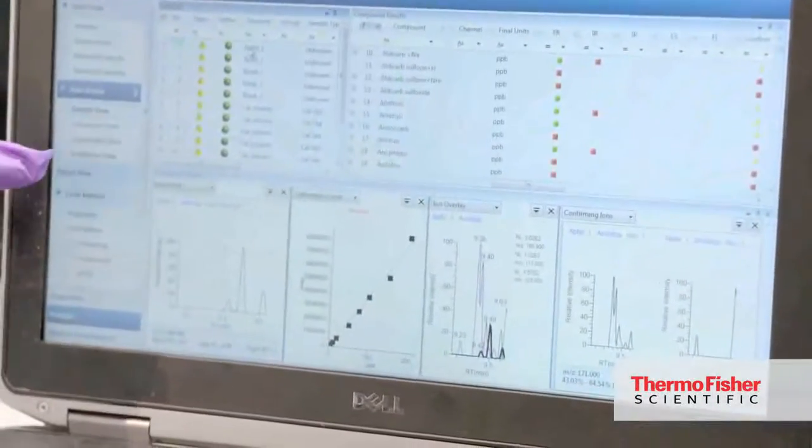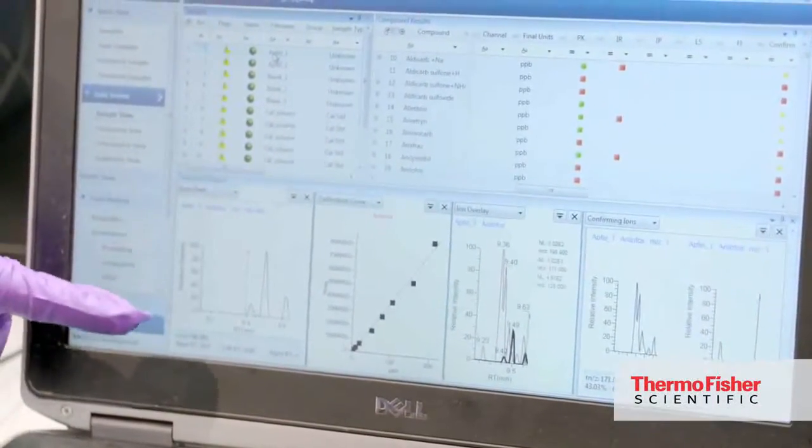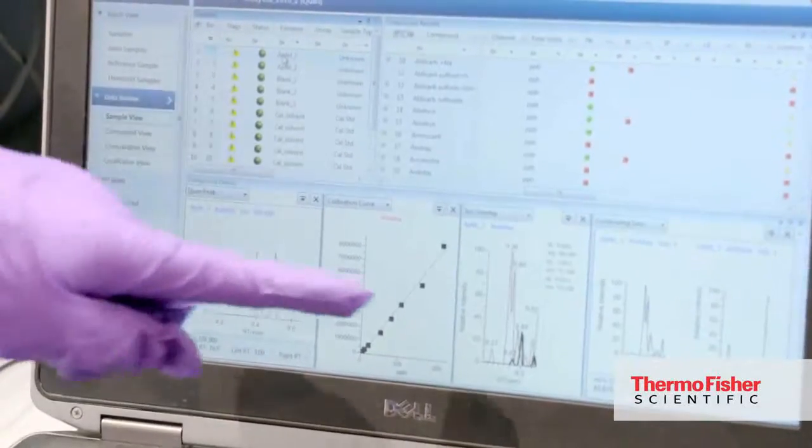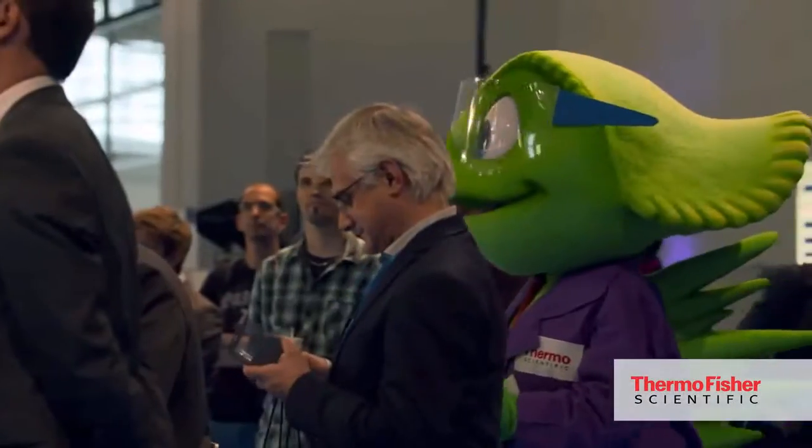Based on the evaluation of data, we have found out that our apple samples are safe, are clean, they contain no pesticides and are safe for the consumers. So we were just distributing these apples to the audience here and they were happy to consume them.